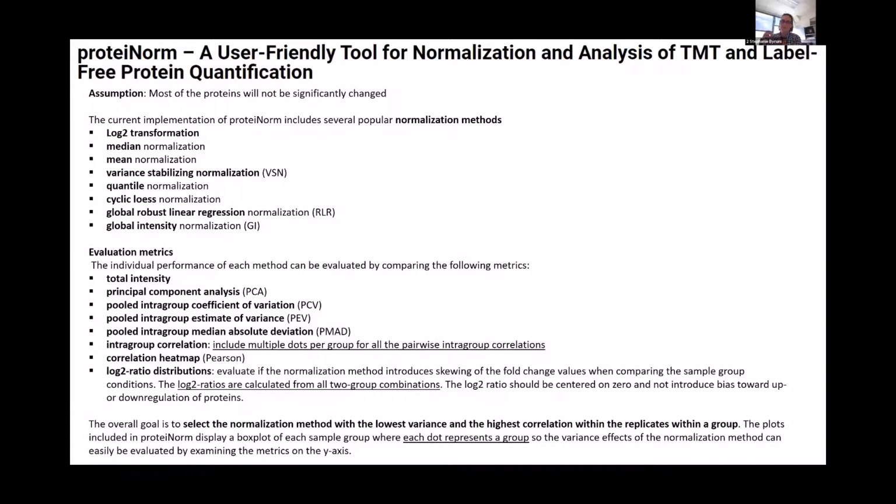So at the PTM level, the low abundant ones tend to be affected by more variance, and VSN tends to handle that better. I actually did one of our phospho projects just before this. I ran all 8 of these methods on it, to see how the differential expression changes at the end and what drastic differences we see by using a different method.